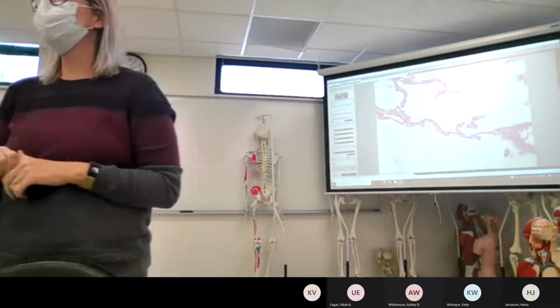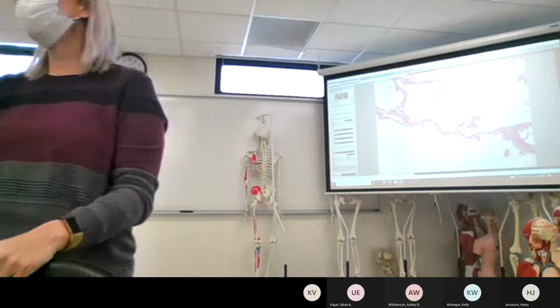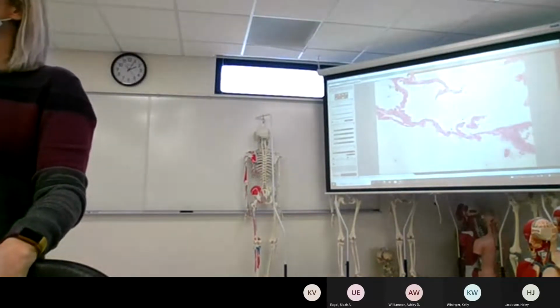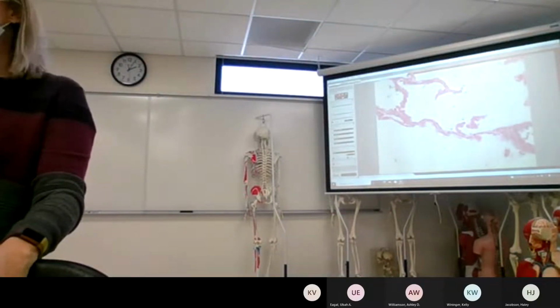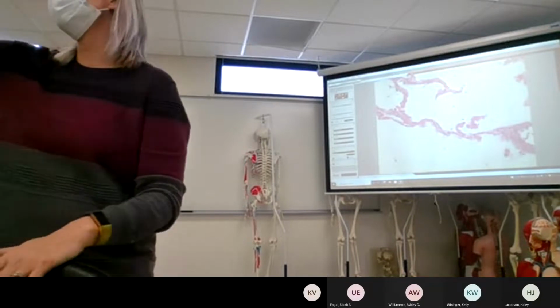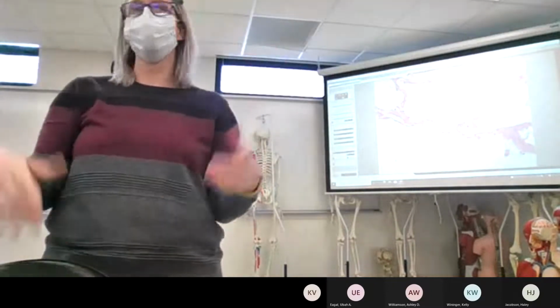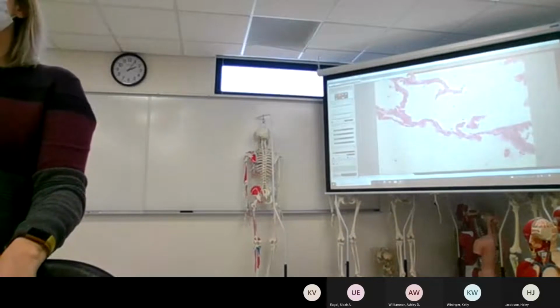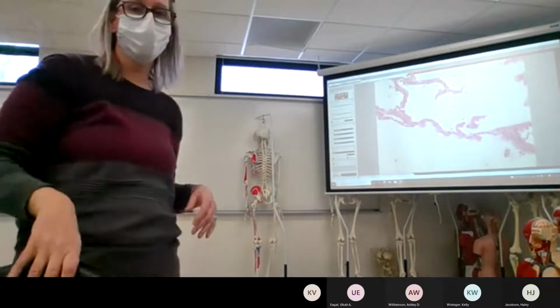After you find your image under the 4x, you'll go to the 10x. That's your low power, and you want to make small adjustments with the fine focus to bring it back into focus. Then you'll go to the 40x, which is your high power, again with small adjustments. If you have a steady hand, you can take pictures with your device through the microscope. There should be a little pointer in your right eye, so you can put that pointer on something and take the picture with the pointer there to capture it.